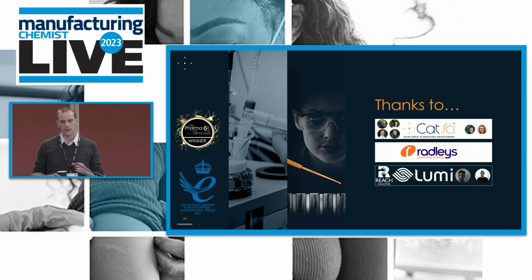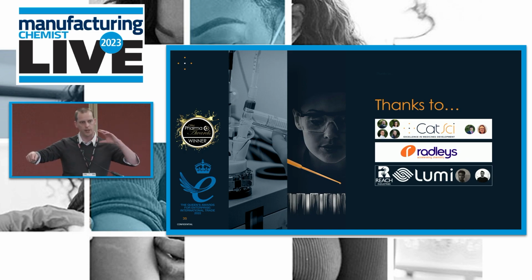Yeah, there are two options. You can run in a relative mode, so you can watch change, and that's easy. The other thing you can do is calibrate the camera. As long as you have something in the shot which is a known color, you can map to that color. I didn't show it, but we have a card with, I think, 12 different colors. You put it in shot, so whatever happens with the light changes, it knows what those colors are, and then it recalibrates the image to match those colors.